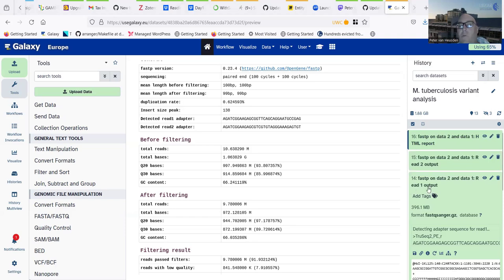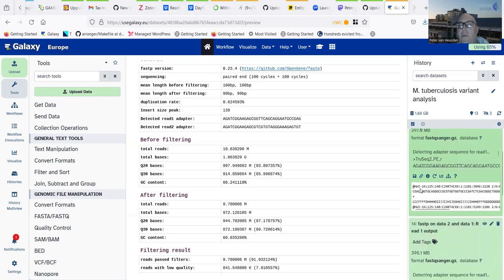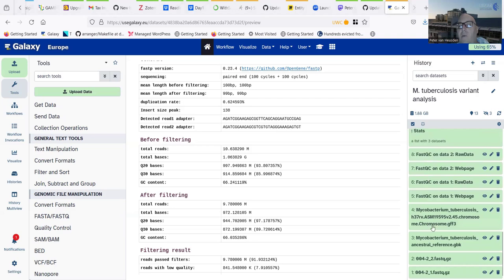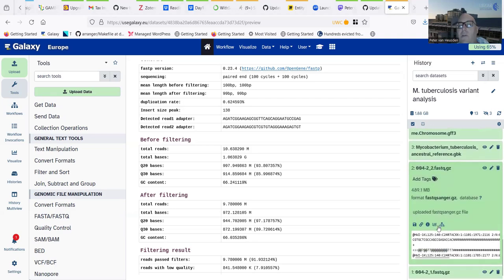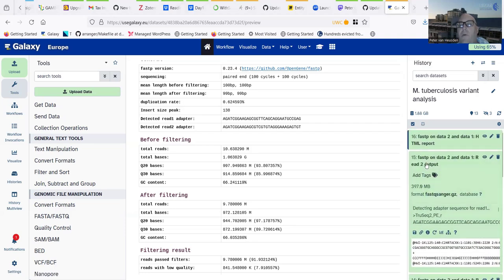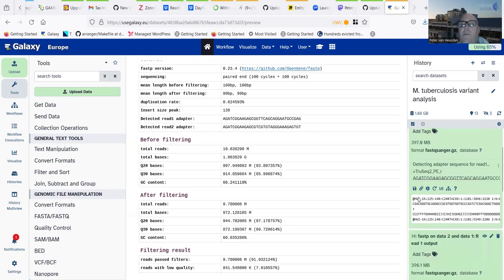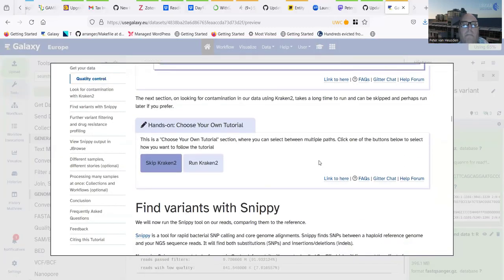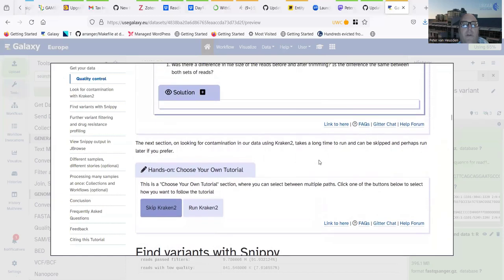Comparing file sizes before and after trimming: read one input was 494 MB, read two was 489 MB. After trimming, read one output is 396 MB — we've lost about 100 MB in the quality trimming process. This is something to note: quality trimming means removing data. In certain applications you don't do quality trimming, but here where we have more than enough reads, we trim low quality reads so they don't create incorrect variant calls later. Both trimmed files are about 396 MB, similar to each other, which makes sense since reads are paired.